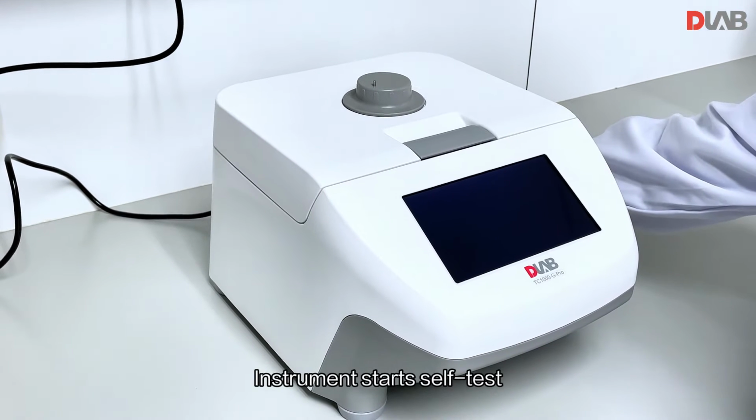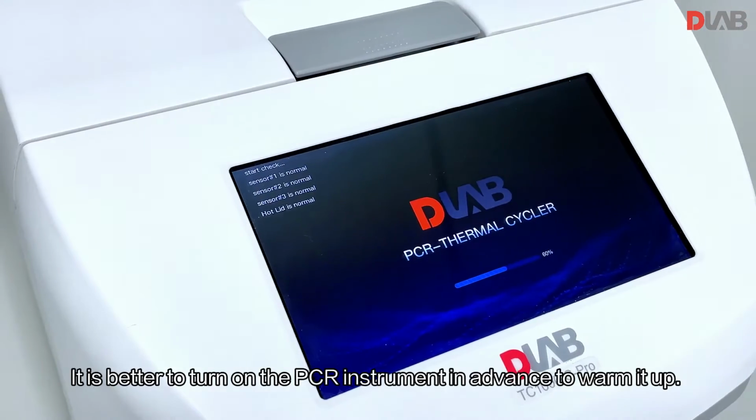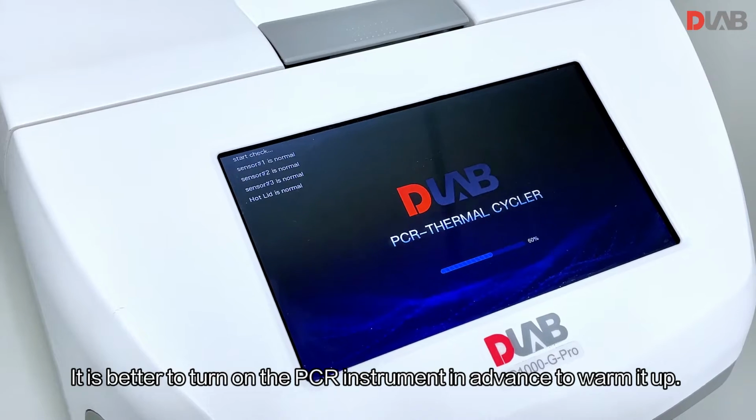Turn on the power switch. The instrument starts self-test. Self-test takes about 20s. Please be patient. It is better to turn on the PCR instrument in advance to warm it up.